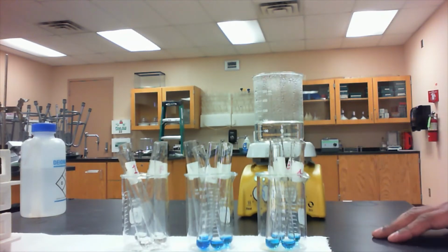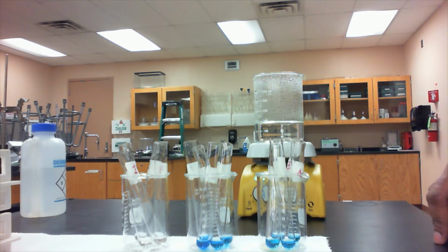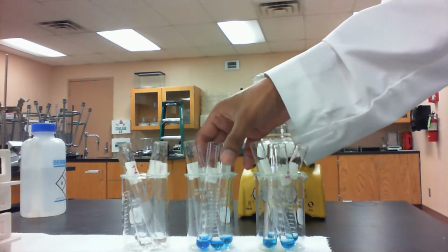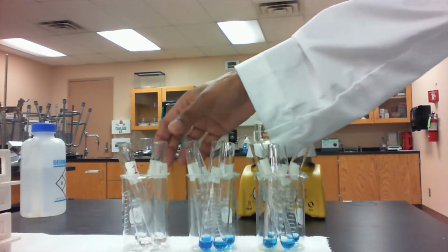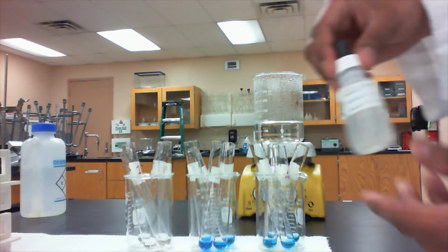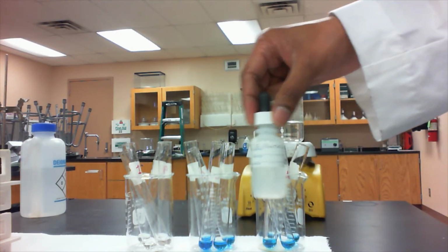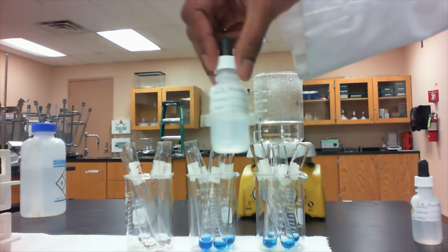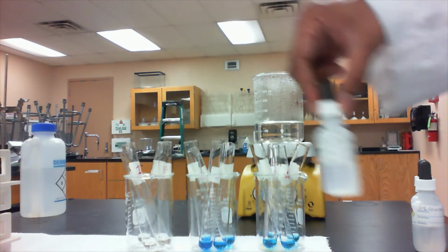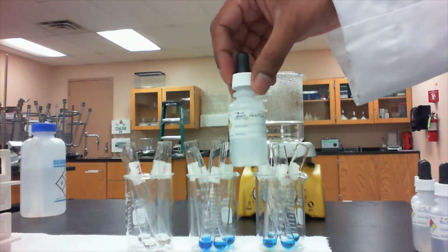Okay, so now that I have my reagents set up, the next thing to do is add the actual sugar solutions to the corresponding test tubes. I have 4 different sugars that I'm going to be looking at today. I have 2% fructose, 2% glucose, 2% sucrose, and 2% lactose.